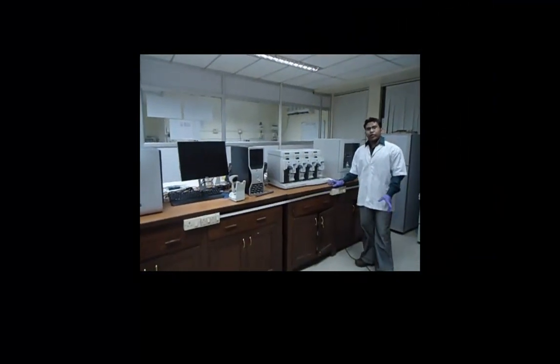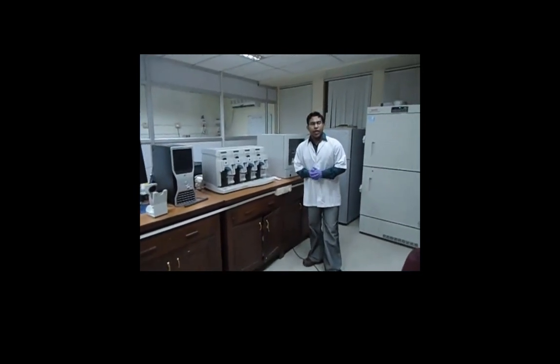Coming to the microarray technology, microarray is also known as the DNA chip or the biochip, in which one silica plate or glass plate is used on which the array of DNA or the complete genome sequence of a particular organism is imposed, and it is used for this very purpose in microarray technology.